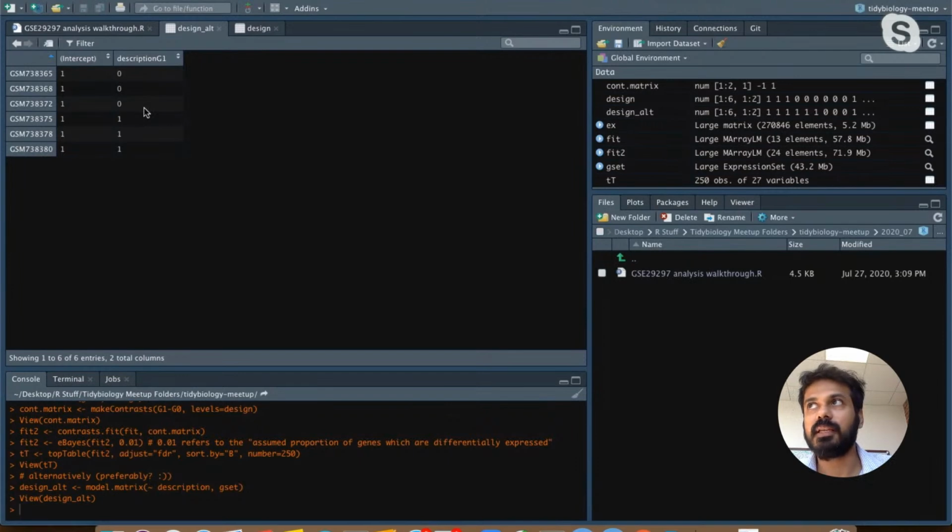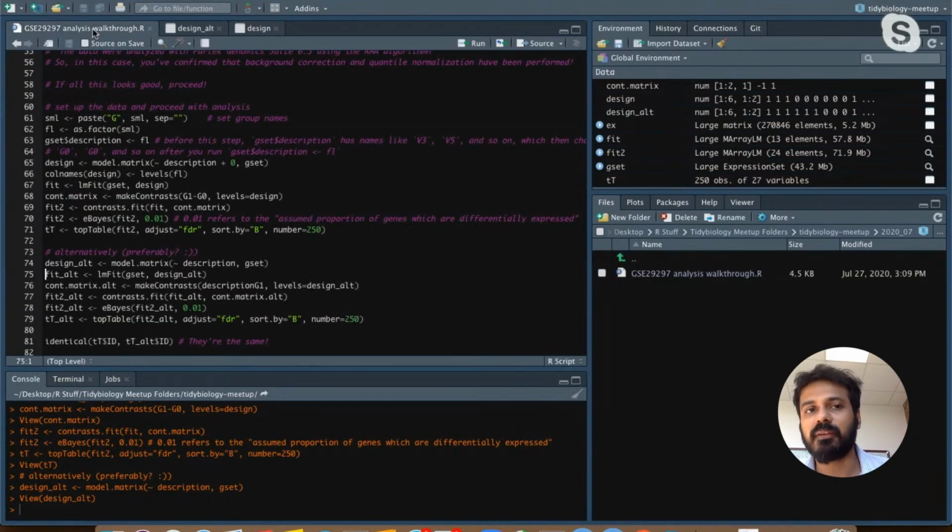which, as I mentioned, is the difference in the mean expression between the two groups, it has a 0 for group 1 because that's what you're comparing it to, and it has a 1 in group 2. So group 1 is just beta 0, and group 2 is beta 0 plus beta 1. So the t-test you're doing is comparing beta 0 with beta 0 plus beta 1. I just find it easier to keep track of what I'm doing using this design matrix.